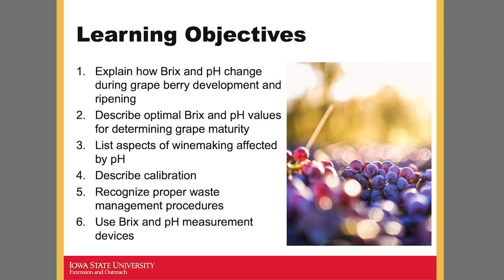You'll actually be able to see me demonstrate how to use this equipment. We'll go through some calibration and then measure Brix and pH. And then we'll also talk about some waste management procedures.